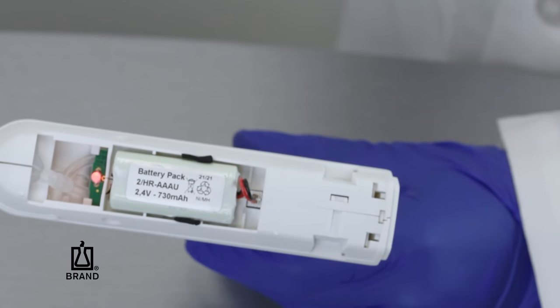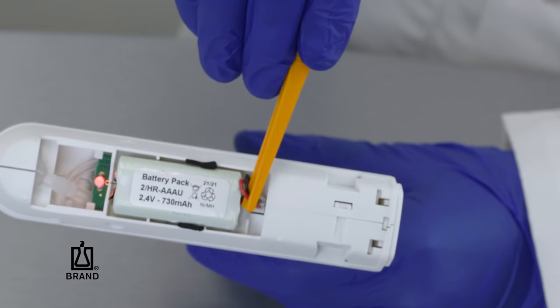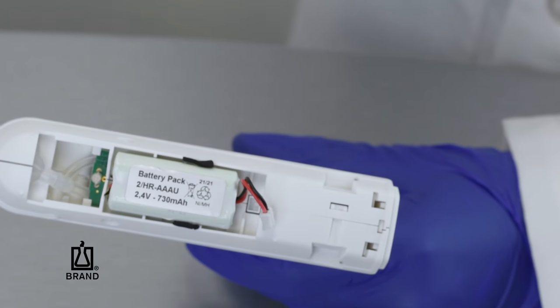If you need to remove the battery, simply unplug it from the AccuJet S by tugging gently on the connector.